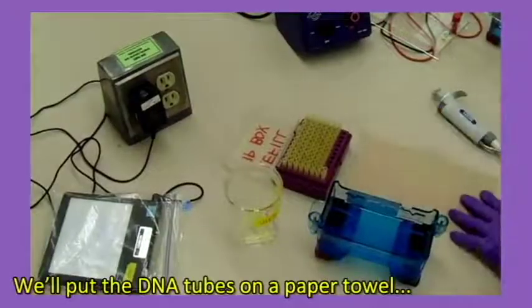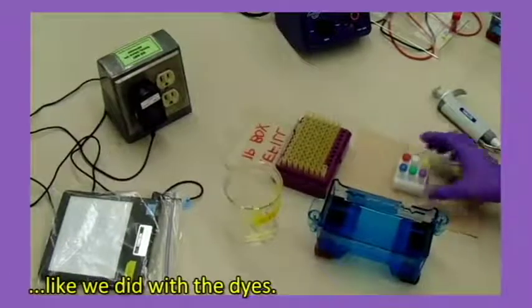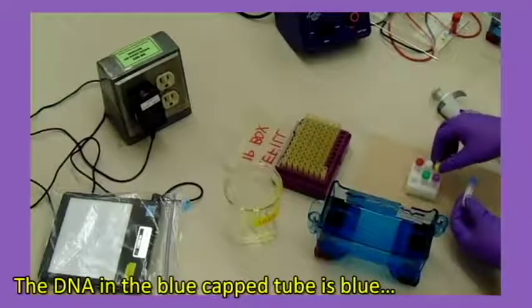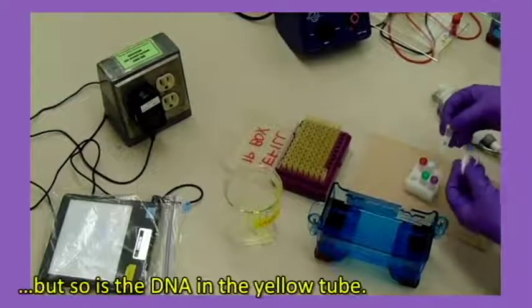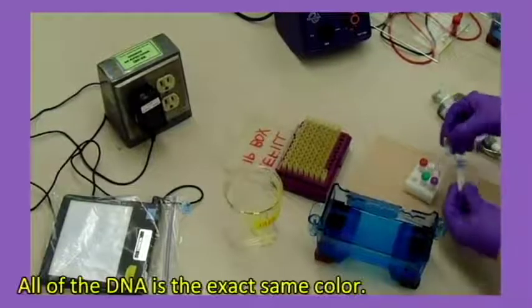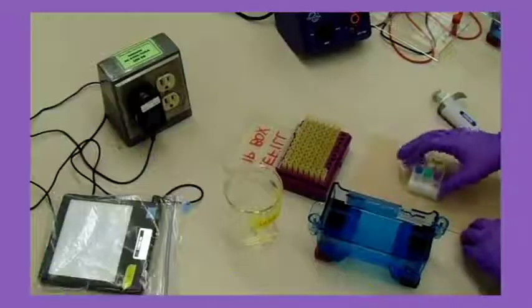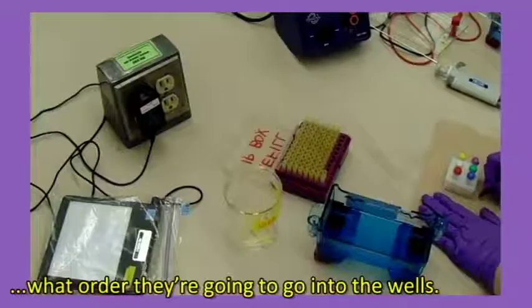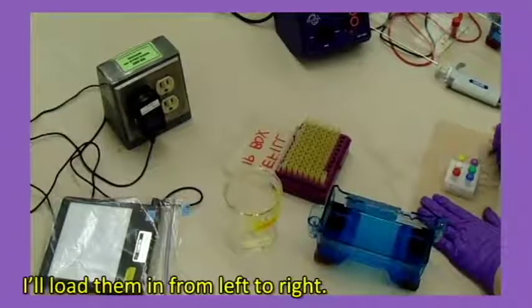We'll put the DNA tubes on a paper towel like we did with the dyes. The DNA in the blue capped tube is blue, but so is the DNA in the yellow tube. All of the DNA is the exact same color. The only way to tell them apart is to note what order they're going into the wells. I'll load them in from left to right.